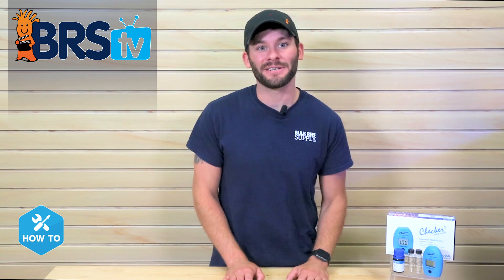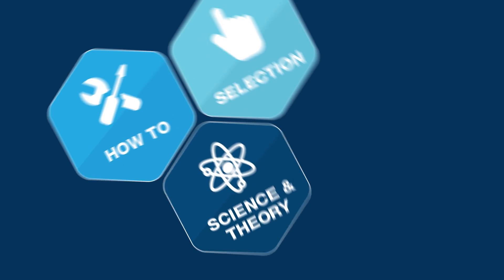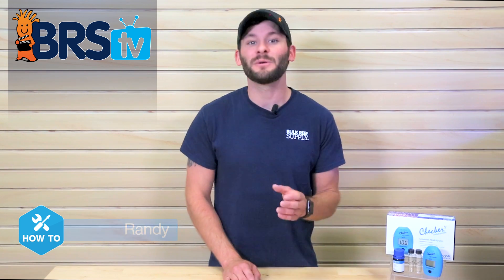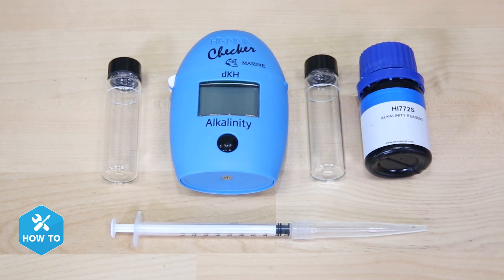Today I show you how to get instant alkalinity readings for your tank with the push of a button. Hi guys, I'm Randy and today's BRSTV How To, I'm showing you how to use an alkalinity checker from Hanna Instruments to take the guesswork out of testing your water.